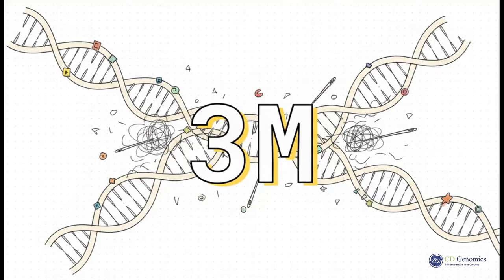And this number brilliantly illustrates the sheer, mind-boggling scale we're dealing with. If you look at a standard plant genome, like corn for example, you're going to find roughly 3 million of these single-letter variations just scattered throughout the genetic code. They pop up about once every 1,000 base pairs. So when researchers are genotyping, they aren't just looking for a needle in a haystack. They're looking for a microscopic needle in a massive haystack.